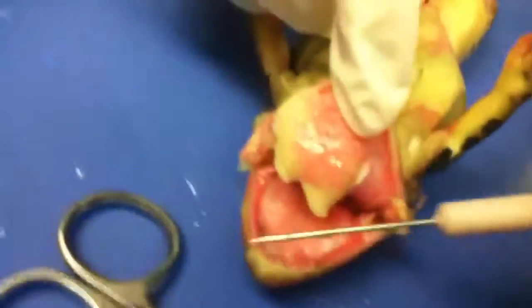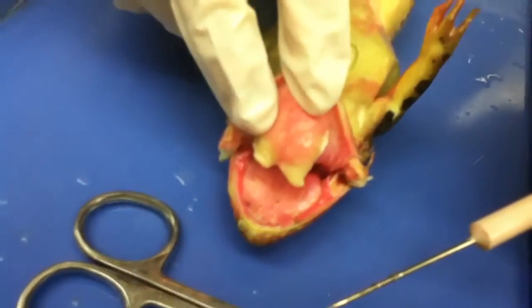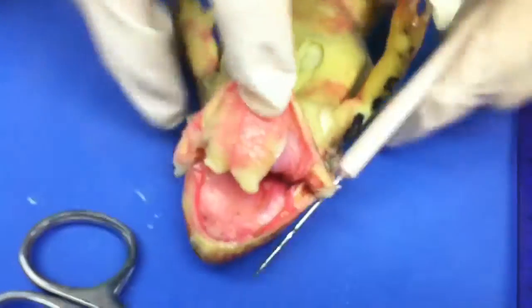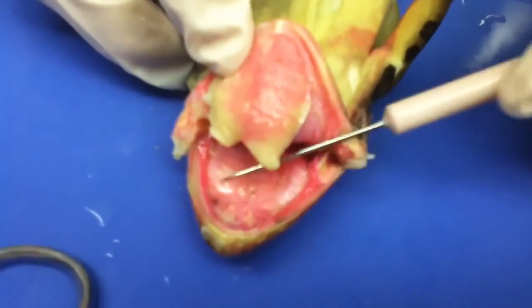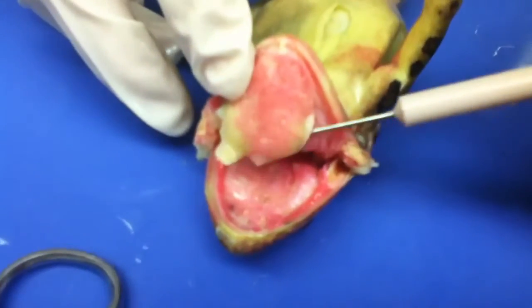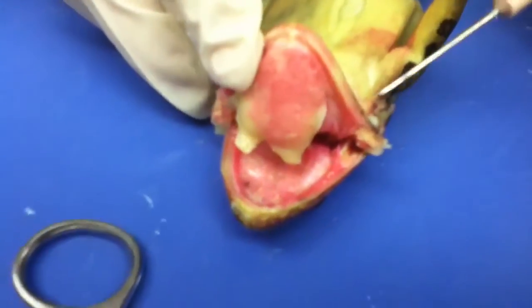A frog does not chew its food. What do the positions of the teeth suggest about how frogs use them? Because of the teeth — it's up here and like sandpaper — I think he like sucks on them. But then there's these two teeth that are really tiny. There's these two teeth right here that are kind of sharp, so I guess he would use those — they're kind of like molars. I think he would mostly suck on his food or just swallow it whole.